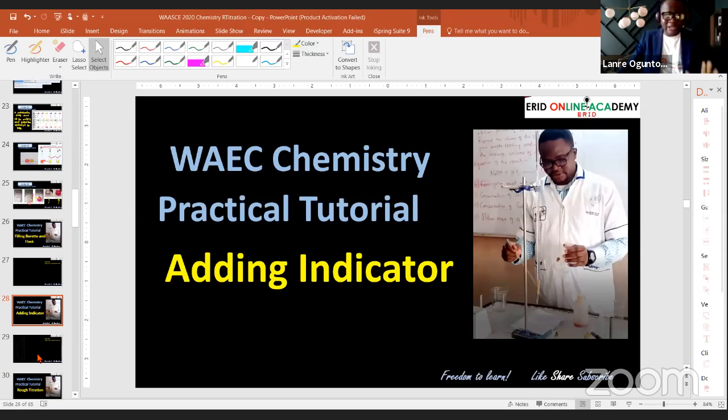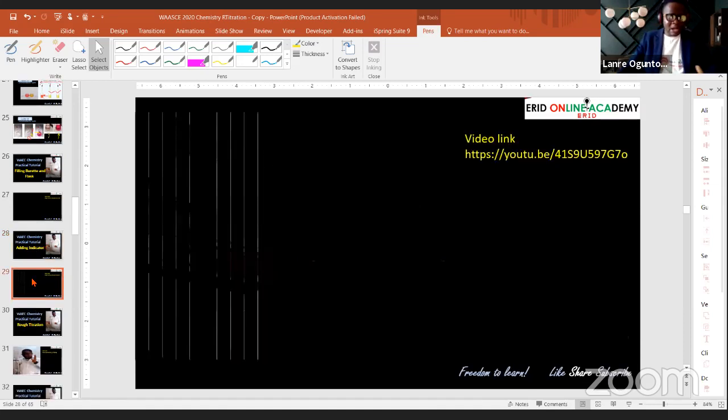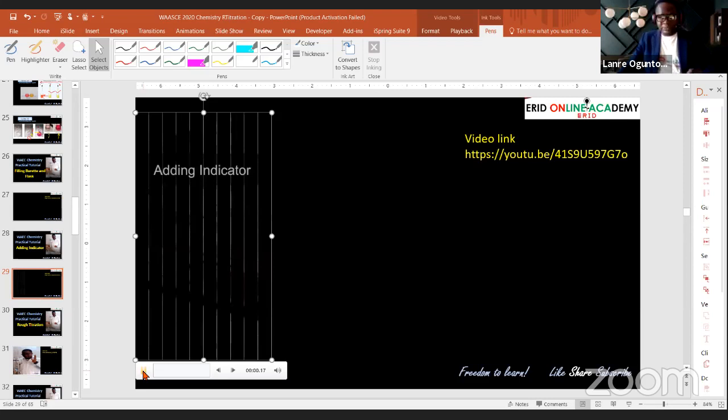How do you add indicator? Okay, so depending on the setup in your school that is provided for you, I need you to watch this laboratory demonstration on how to add your indicator, methyl orange indicator.